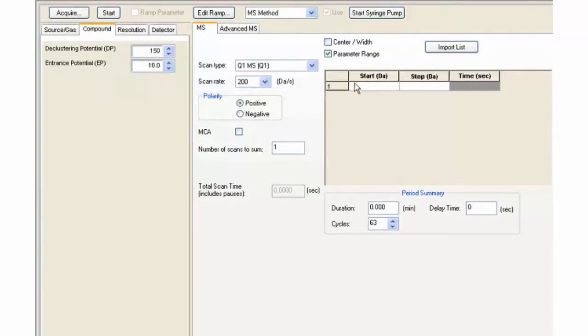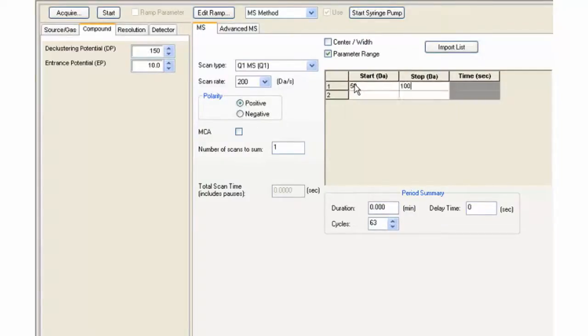Next, enter the mass range. Let's start at 50 and stop at 1000.